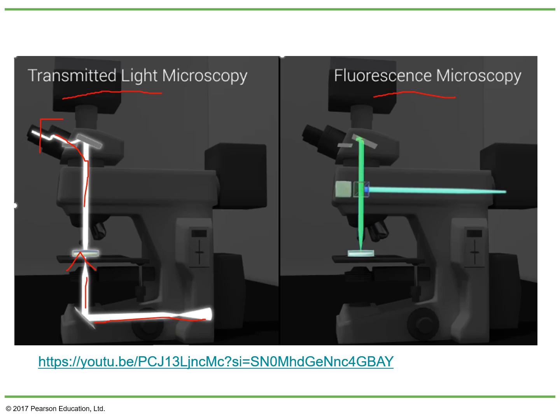On the other hand, in the fluorescence microscope, you need the laser that goes here, in this case blue light, that hits a mirror and illuminates the sample, excites the fluorophore that is there, and as a result it emits a different wavelength, and you can see it with the eyepieces. Okay, hopefully this video is clear, and then I will go through the key steps that they will be in the lab.